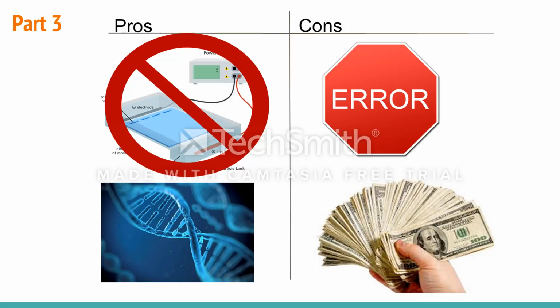qPCR is a method of amplification that gives you results simultaneously as the process is occurring.